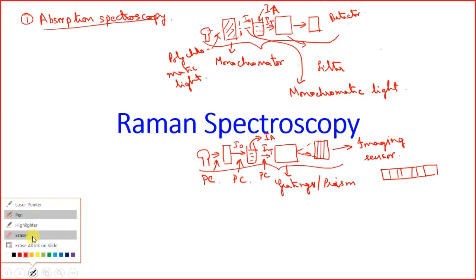In the second case, we had fluorescence spectroscopy.